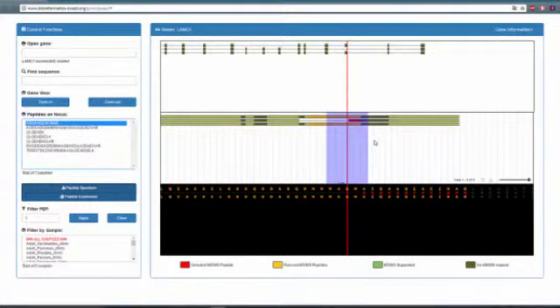For example, I show here only a small example of a protein called LAMC1, laminin gamma chain. We got public proteomic data and used a database in which we predicted uncommon or novel isoforms based on RNA-seq data, together with reference sequences from UniProt. And you can see here the data is loaded. You have the reference protein on the bottom here.